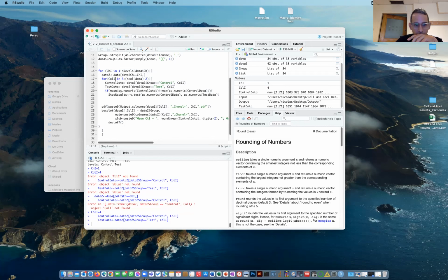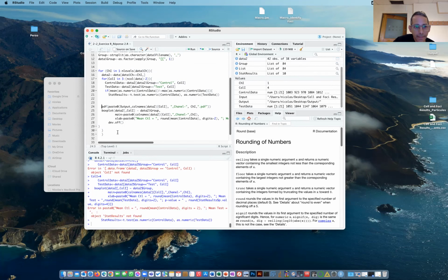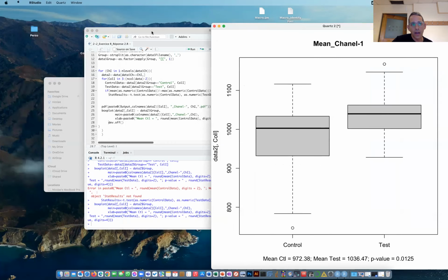what we can do. So I want to plot box plots because I have a lot of data, and I think box plots are pretty good to show you data and how the data is split. So you run this line, and it's basically just making the graph itself. I can tell you what has been written.